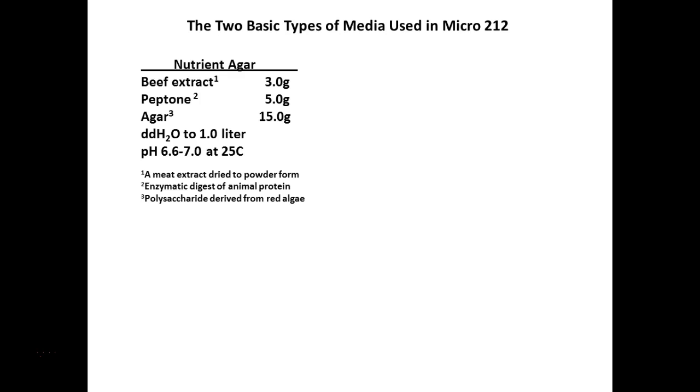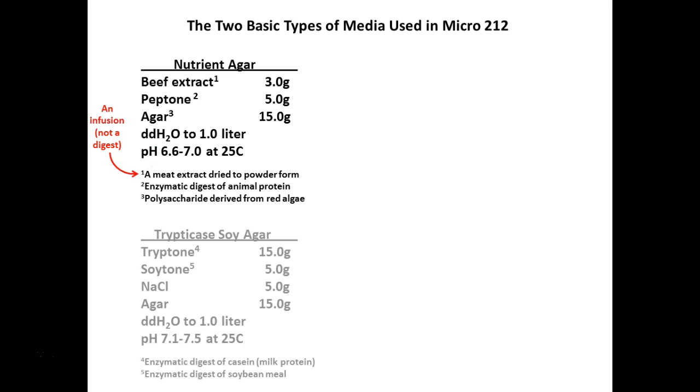So nutrient agar is what we used to primarily use to propagate microorganisms, to grow them. But we found out that that actually isn't the richest or happiest media for them. They actually all do really well. And I know this because all of the organisms, for the most part, I grew on TSA, which is trypticase soy agar.